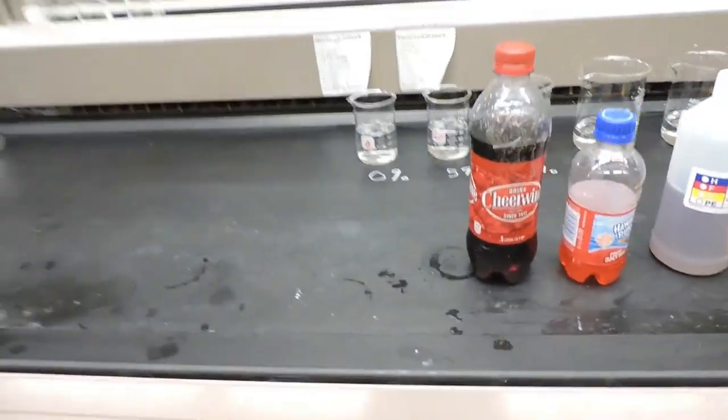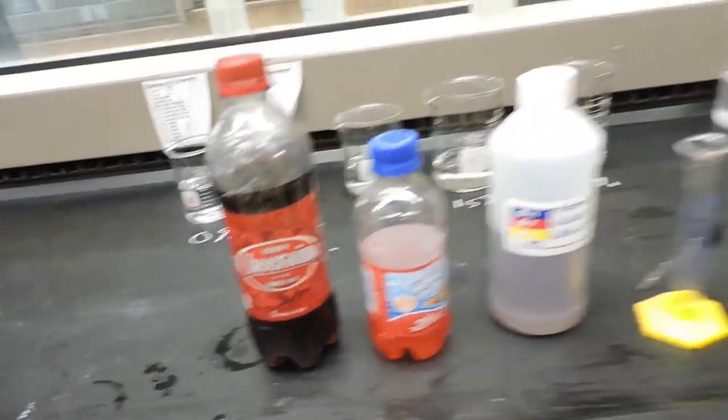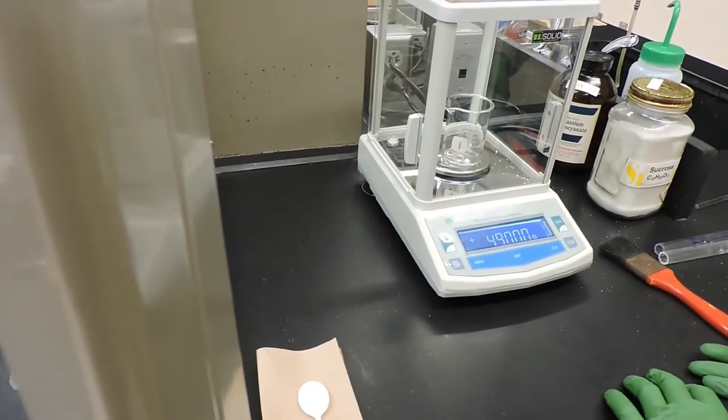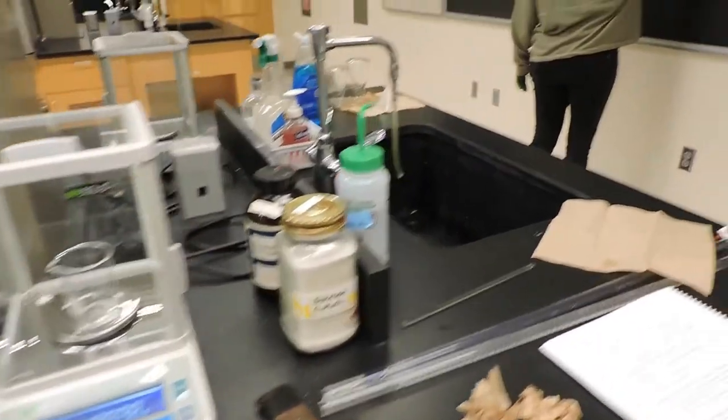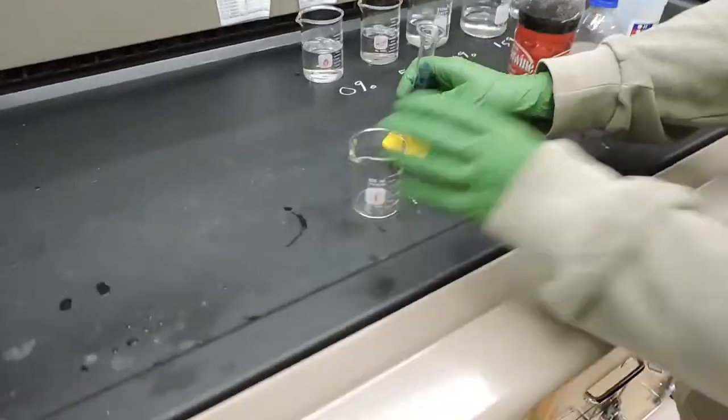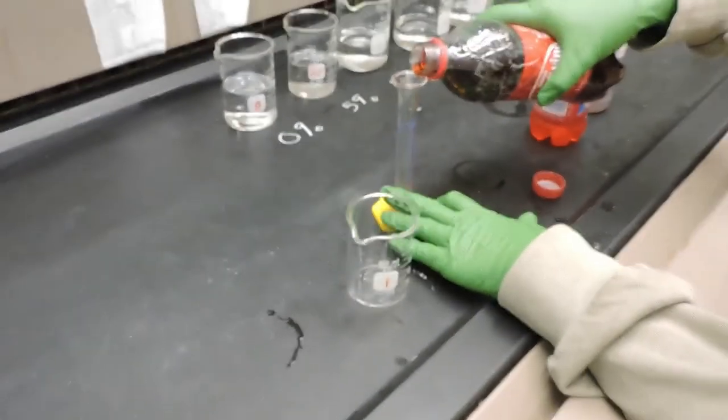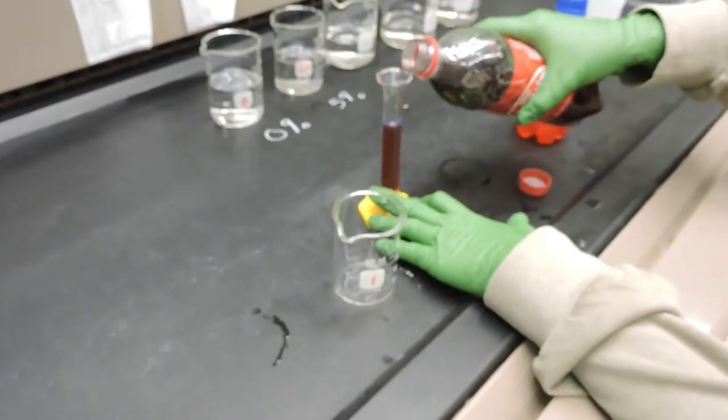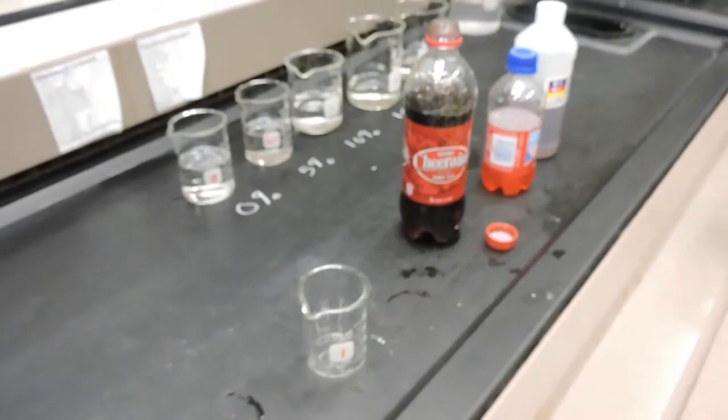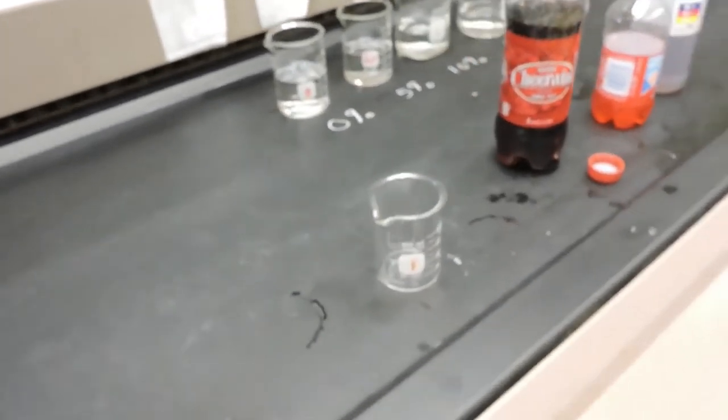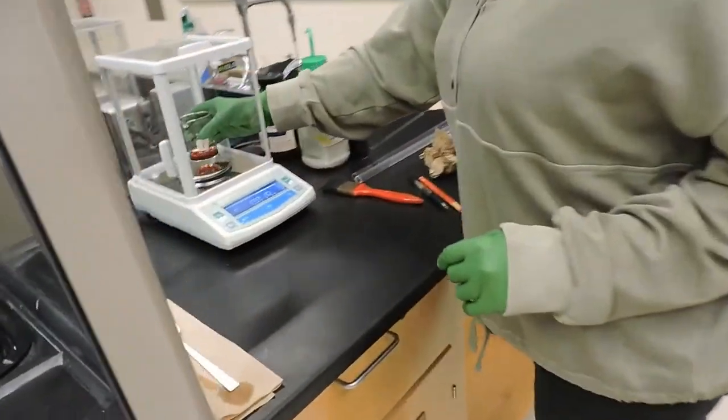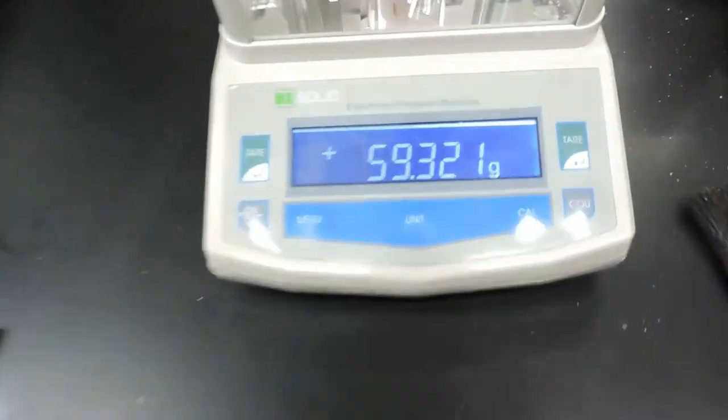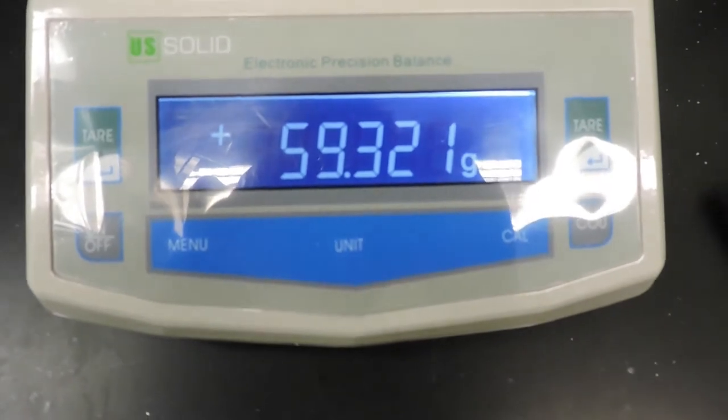So to determine the density of the Cheerwine, we're going to take the empty beaker and weigh it. And the mass of the empty beaker is 49.000 grams. Then we'll add 10 milliliters of Cheerwine. And now 10 milliliters are in the beaker, we'll find its mass again. And the difference will be the mass of the Cheerwine. So the mass of the beaker plus solution is 59.321 grams.